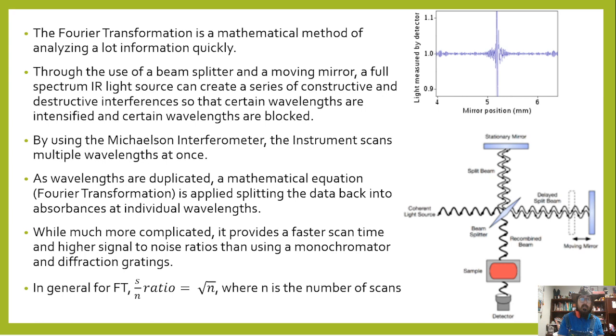And so it can scan a lot faster and give a higher signal to noise ratio than just using a monochromator and diffraction gratings.